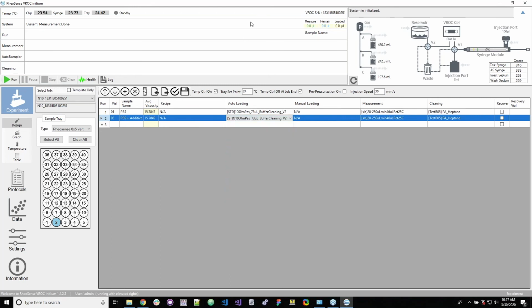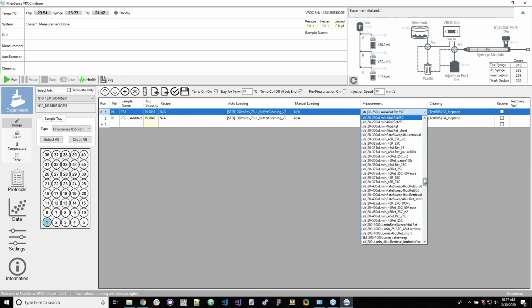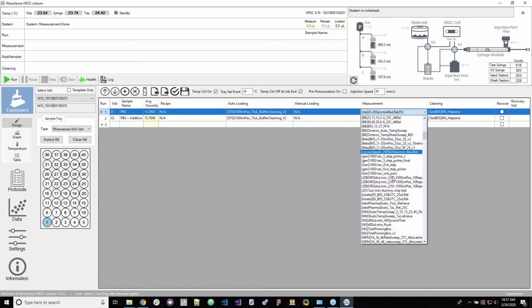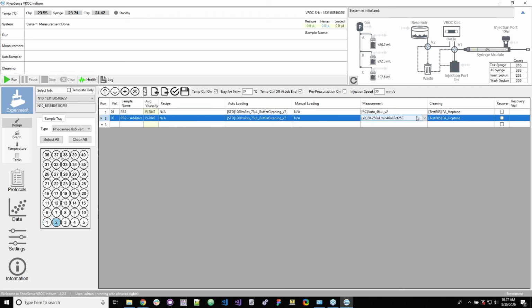So standard buffer cleaning. As for the measurement, I have no idea what the viscosity is of either of these, so I'm going to select an automatic mode run. So just need to find one. There's a lot of measurement protocols. So we have our automatic mode here. And if you move on, you can actually get some description information. So this one retrieves at 46 microliters.